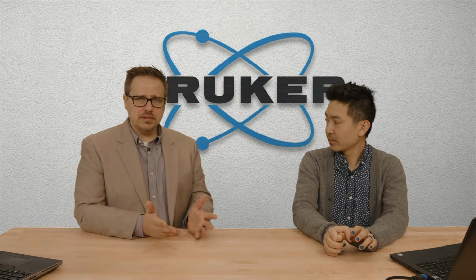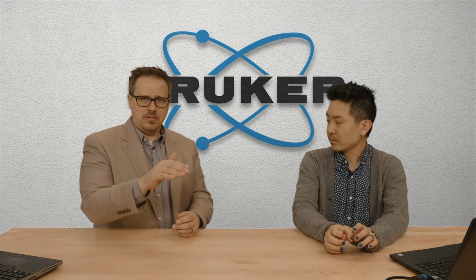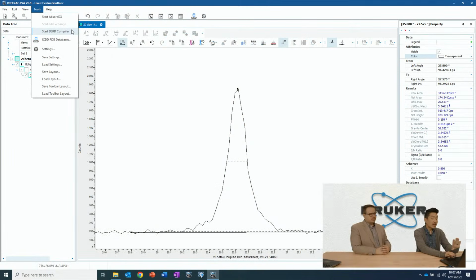So what you do is you go there, you get a license from the ICDD. Then they're going to send you the software, could be a link, could be physical. You're going to install their software on your computer, and you install the database. Then in EVA, among the different programs that come with EVA, there's something called the database compiler. It's actually integrated now into the software.